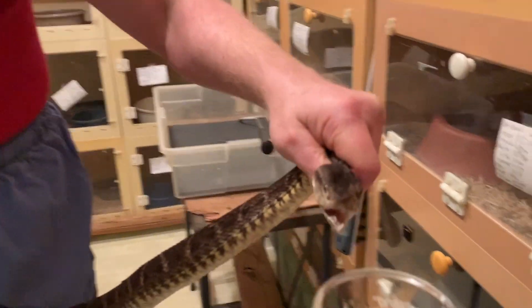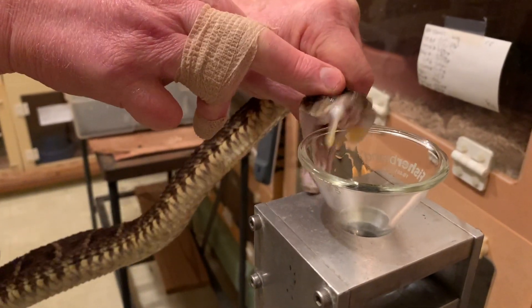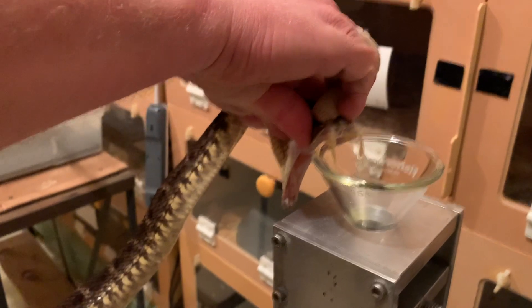We do check our equipment before we start each day. I didn't video that, but we did check it to make sure it was all intact, not breaking or falling apart in any way.